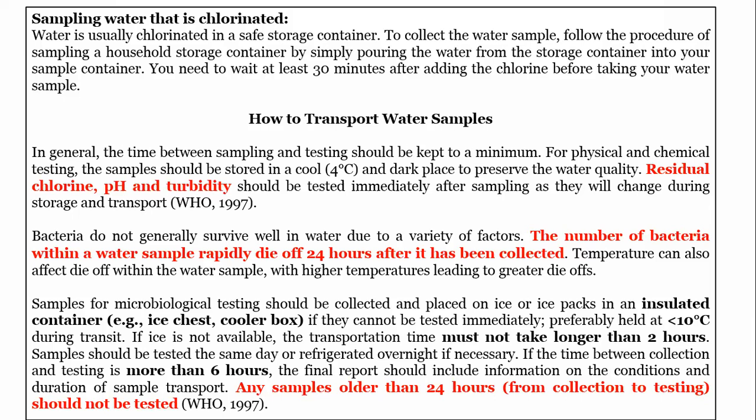Why? Because at higher temperatures, some of the bacteria, by the time you collected this water sample and you don't put it in this kind of cool environment, will die off, obviously. So when you go to the lab to test, you are not going to have the actual contamination value. This is why you need to preserve the water, because at cold temperatures these bacteria will still live. That is why you need this cooler.